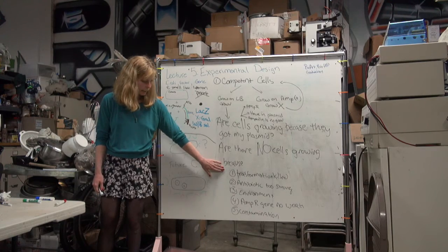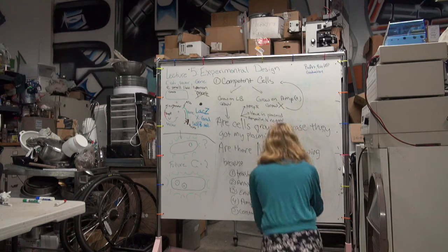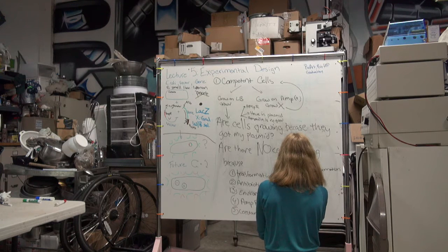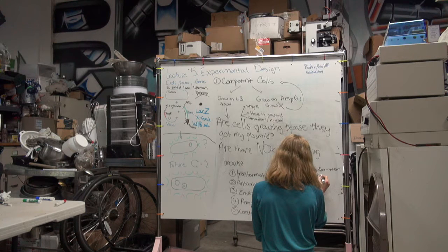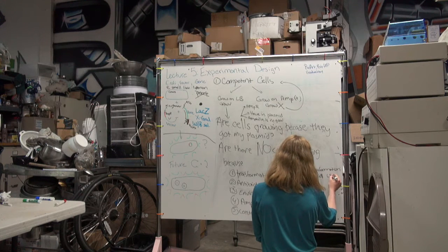Now, the transformation killed them. Well, that's why I do a control transformation. That's something that I know works. And then also, part of the transformation is making sure the cells are viable, so I make sure that I plate competent cells that went through this process. I just plate competent cells on LB just to double check.